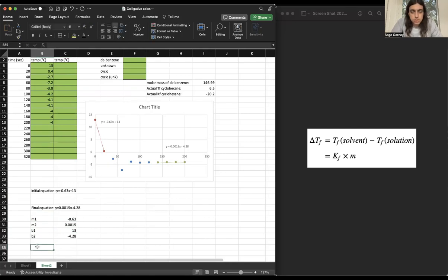So from there, they do give you some equations in your procedure document, where it's basically just y is equal to m1 times, in parentheses, b2 minus b1 over m1 minus m2, plus b1. So let's see, we're going to put that in. I'm just writing this in so you can see it.